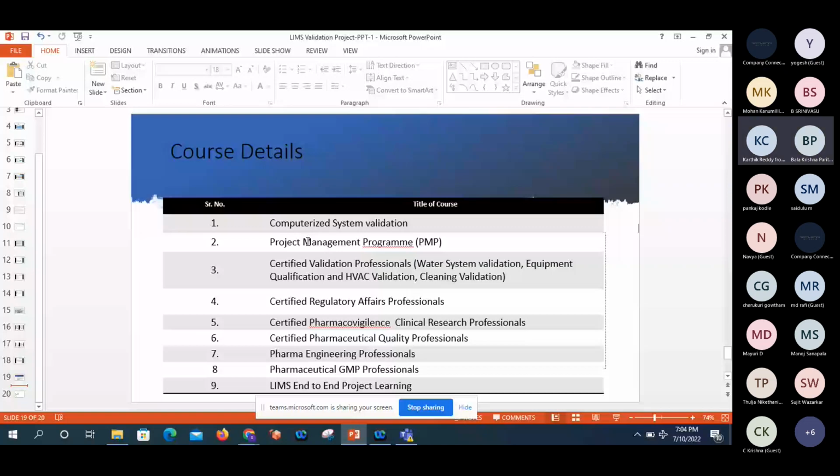Hi, sir, this is Mohan. I have previously joined CSV classes also, and I was working in the master data team in LIMS. In recent interviews we are attending, they were asking about crystal reports. Are you going to discuss crystal reports in this class? No, crystal report is a different thing. We need to take the training from vendors only.